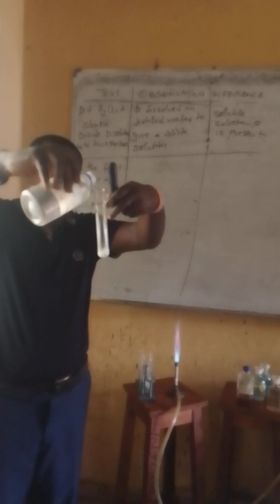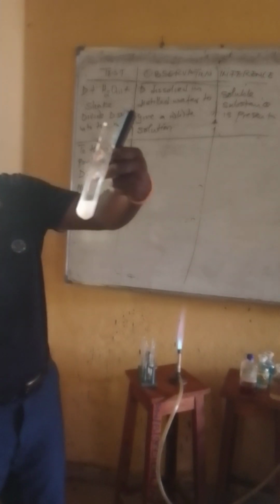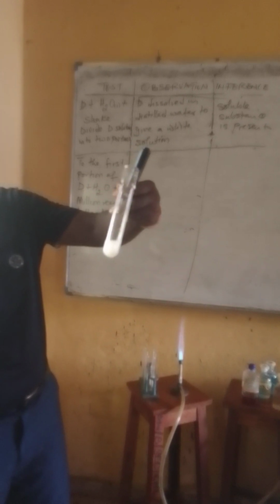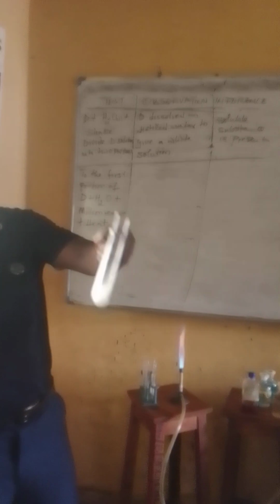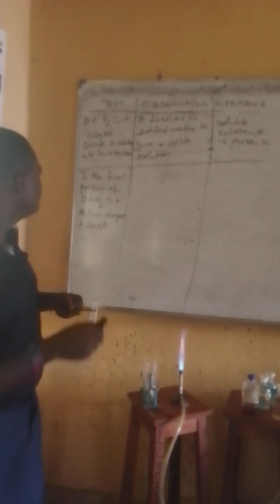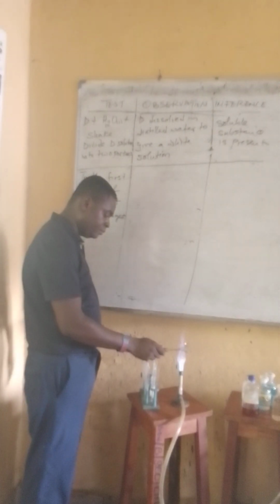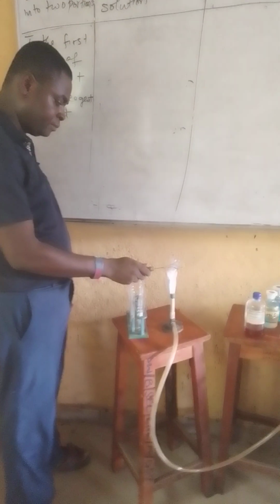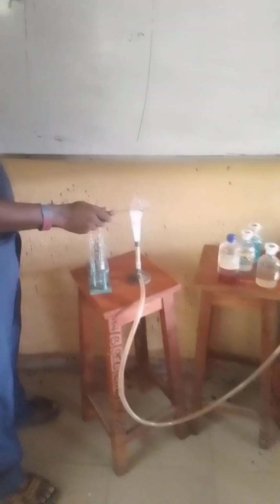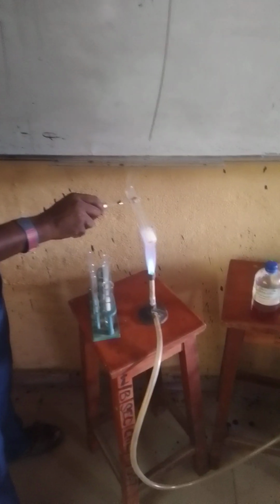Let's observe any color change when we add. No observable color change, so no visible reaction. The solution remains white. So then let's try to heat it. It's just changing.